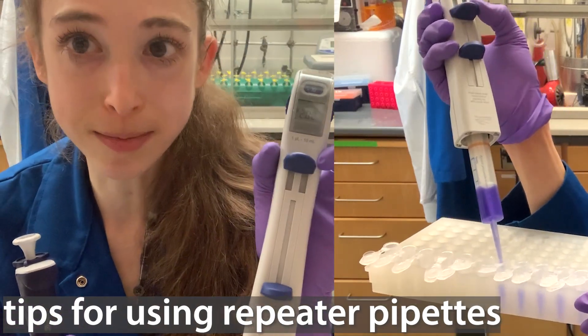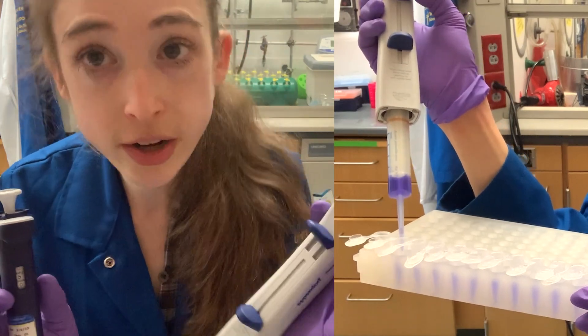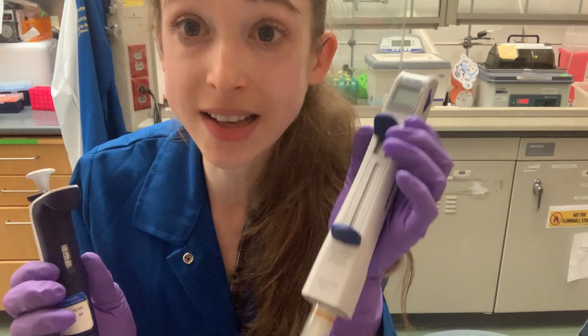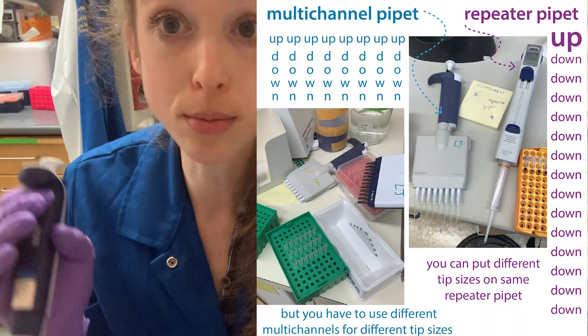Repeater pipettes are a huge time and thumb saver, but they can be a bit finicky to use, especially if you're not familiar with them. So here are some tips for using them. The basic idea with a repeater pipette is that you're able to pipette up once and dispense the same volume multiple times.